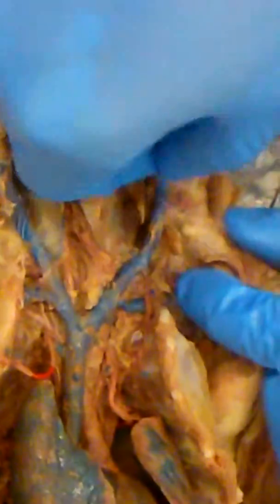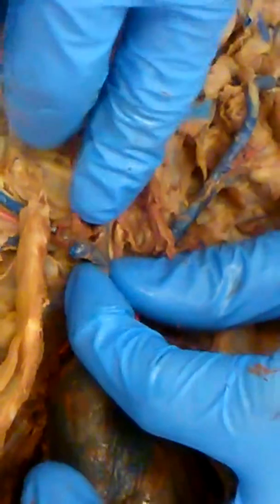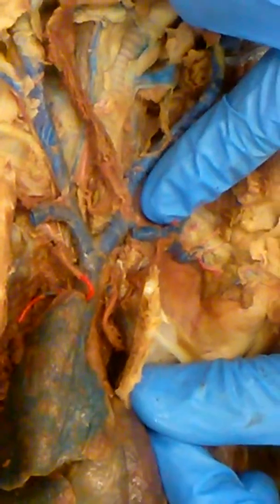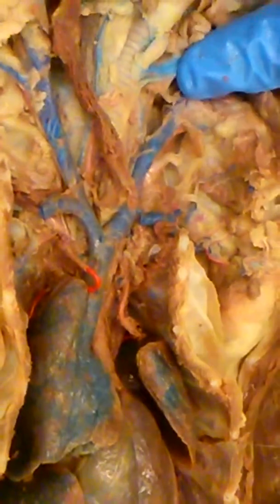So these are the external jugular veins. You can see them go all the way up into the neck. And then the other part that comes off of it, so here it's cut, that's your right subclavian, and over here is your left subclavian. So the Y part is the brachiocephalic vein. Right here and right here. And then right and left subclavian and external jugular. Yeah. Okay.